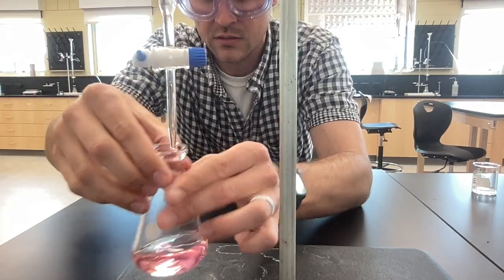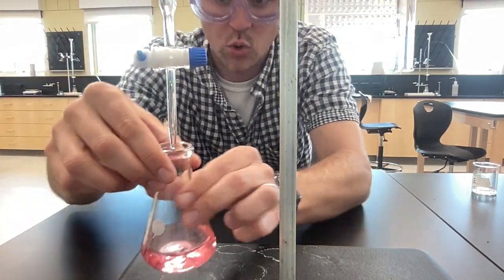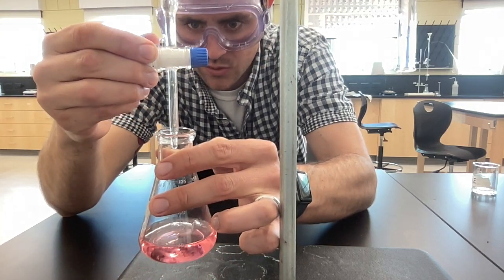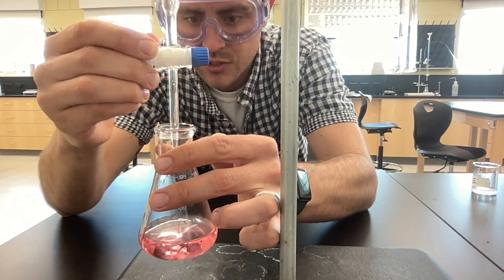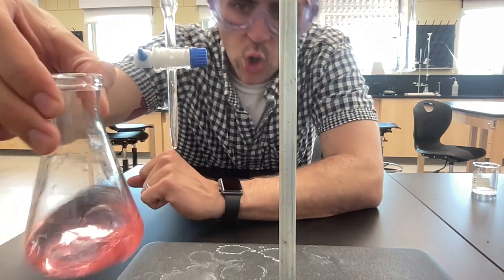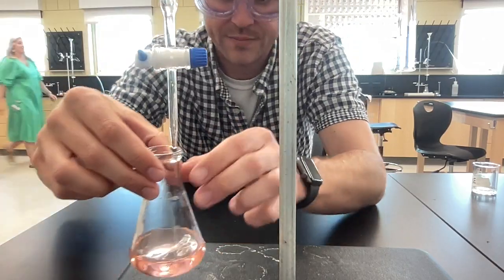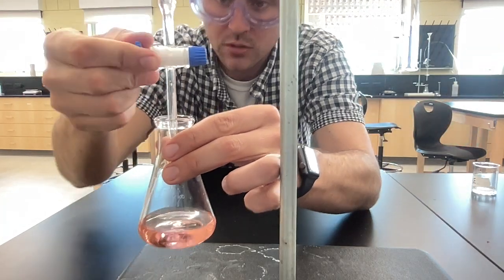And 20. At 20, I would love to see it just go green, but it's a strong acid and a strong base, and it's going to be a really, really small window of color change there. Oh, one drop. Come on. One drop. Do it. Oh, it's yellow. Oh, it went back to pink. I got too excited for nothing. Come on. Oh, gosh darn it.